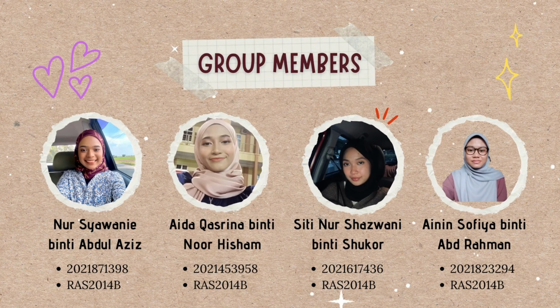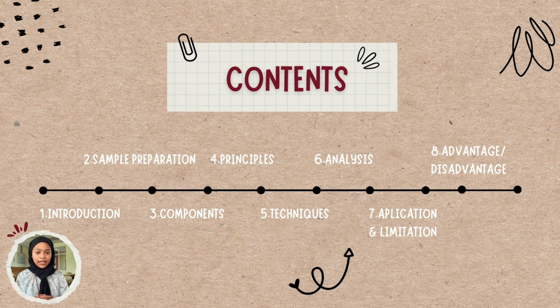And this is our team members. And this one is the contents that will be discussed in this demonstration video.